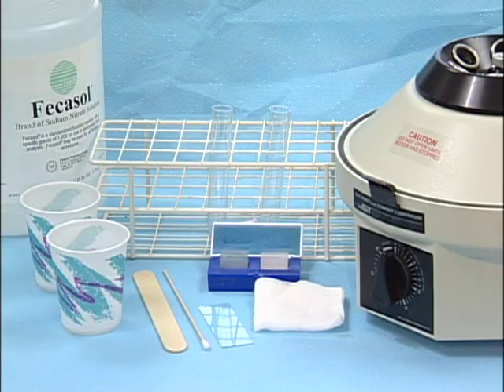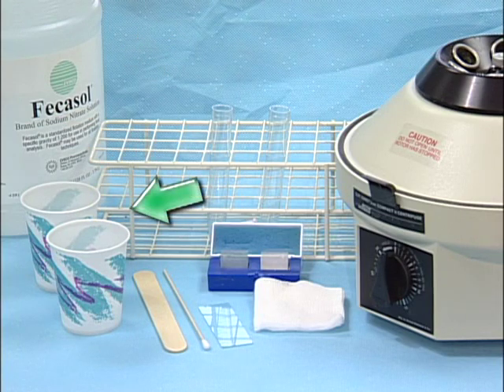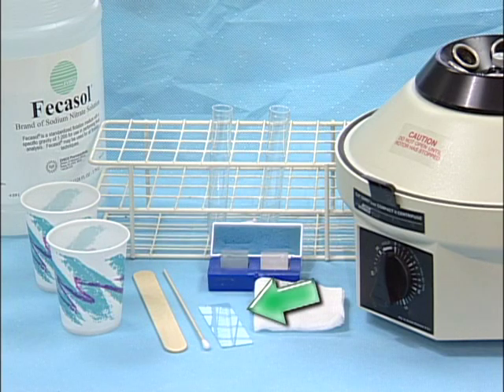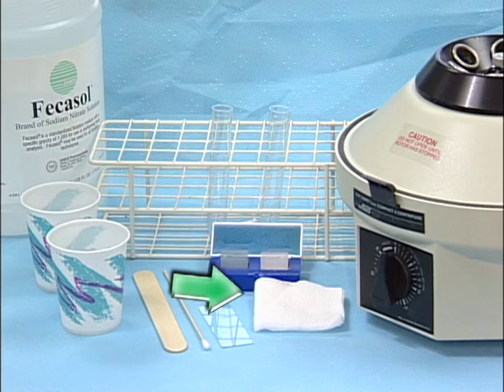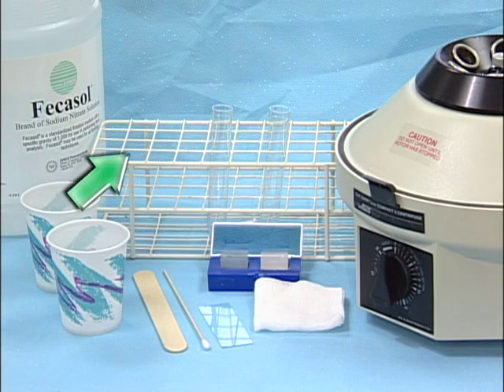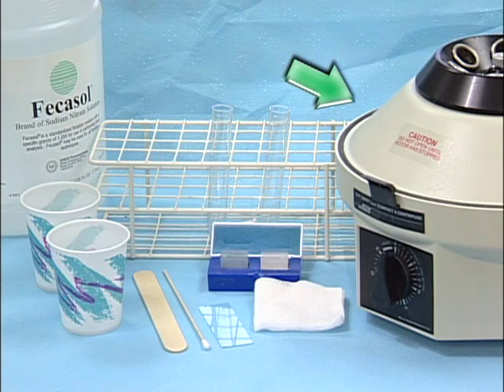The equipment necessary for the centrifugation fecal method includes fecal solution, two paper dixie cups, a cotton tube applicator stick or tongue depressor, slides, cover slips, either a 3x3 or 4x4 gauze square, two conical 15 milliliter tubes, a test tube rack, and either a swing head or fixed head centrifuge.